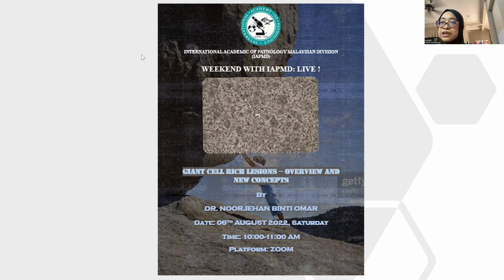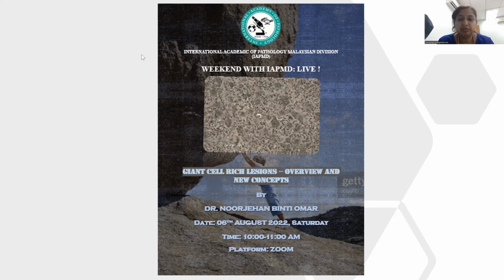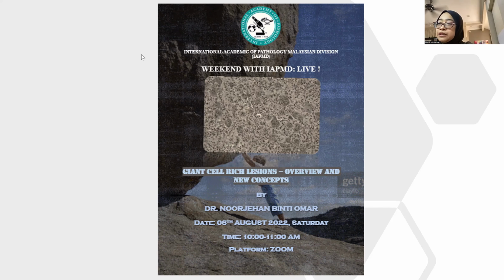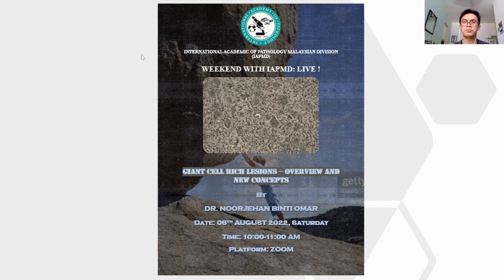But the sectioning is a bit delicate. It's 1 micron thick. Yeah, 1 micron, Mohan. Technical wise, they have to get used to doing it the proper way. So I suppose we should all be mentally ready for all of that work in order to optimize the staining.